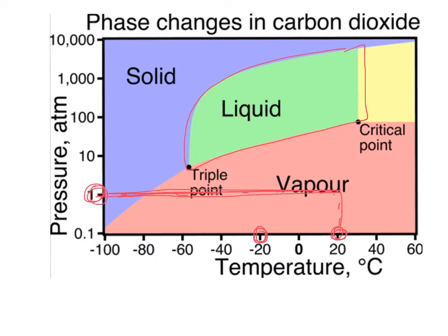And so this is very convenient if we want to, say, ship something that needs to stay cold over a long distance and we want to pack it in ice, but we don't want the ice to melt. So we can pack it in dry ice, and it will turn directly to a gas over a period of a few hours or a few days. And as a result, we can keep it nice and cold without making a big mess.